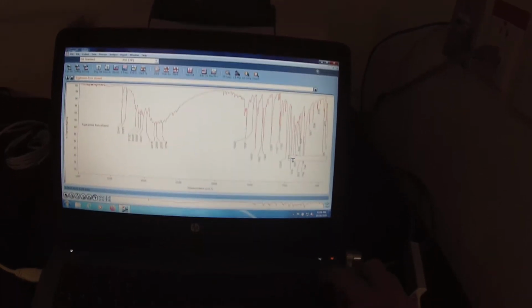We just kind of clean things up a little bit. 897, right? That's a peak that's really tiny. There's no real need for seeing really tiny peaks. This one's probably not real either. So I want to label the biggest ones, but not label all these little tiny peaks in the middle.